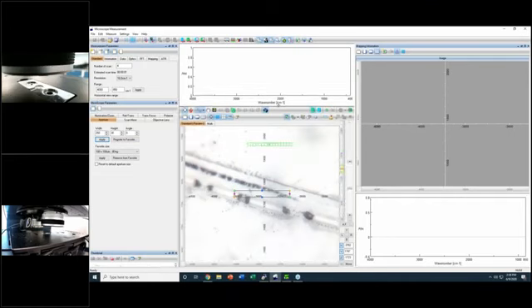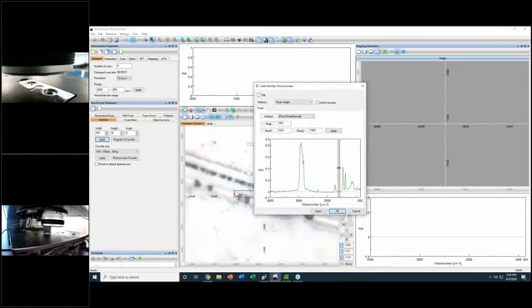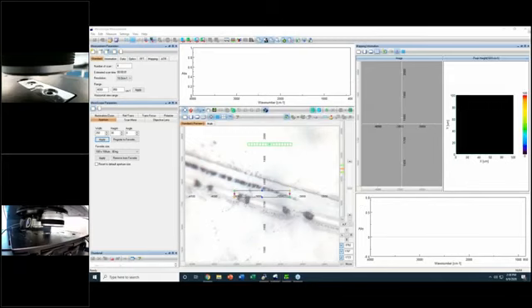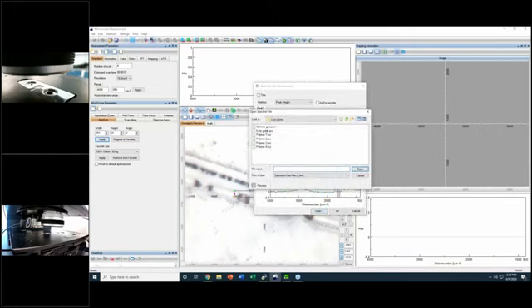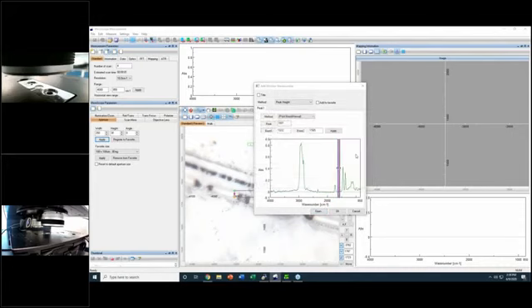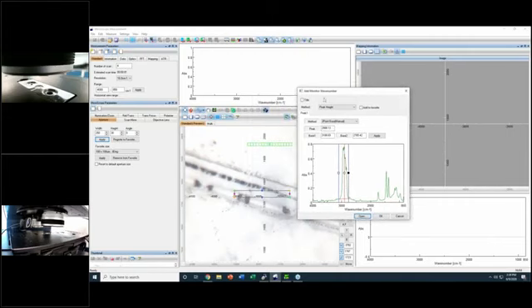and I'm going to load the functional groups that I would like to show today. The first is the Aliphatic Group. I can open it up, and I'm going to do the same as I showed before. We are going to be doing the mapping using the peak height of the functional group, and we can come here and include the name. This is the CH bonds, or the Aliphatic Group.